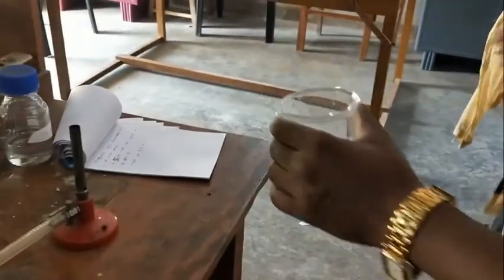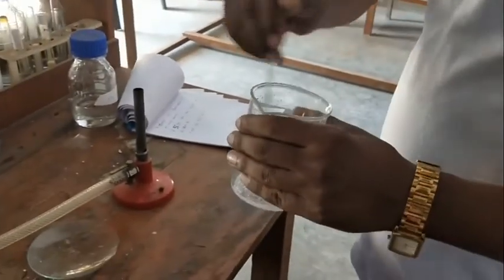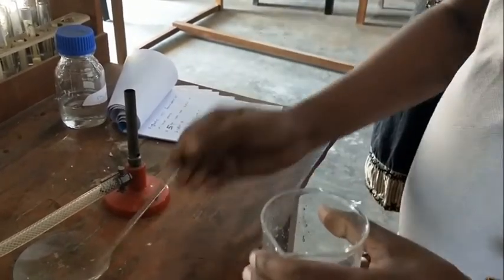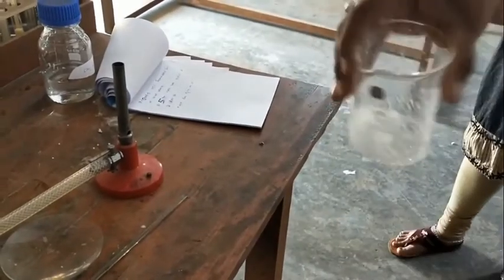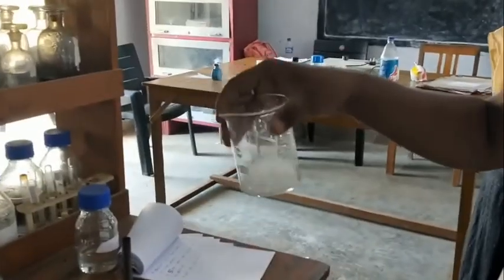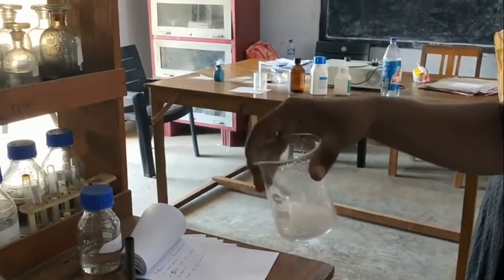He is dissolving it. Now he has taken the glass rod also. Now this mixture is properly stirred for 5 minutes.